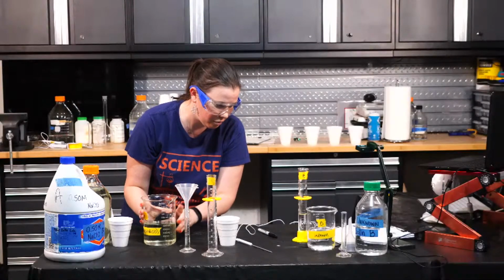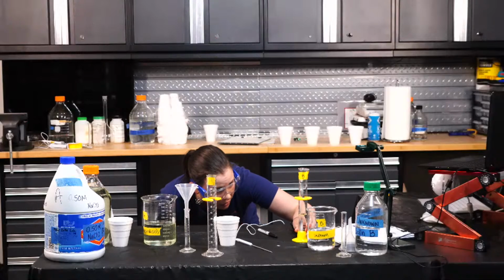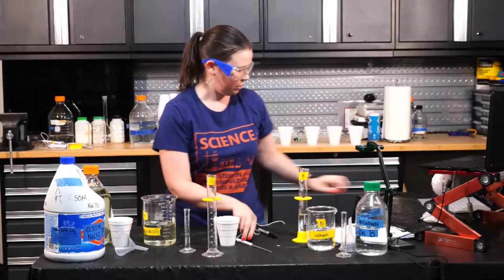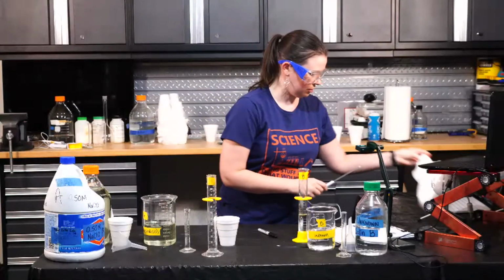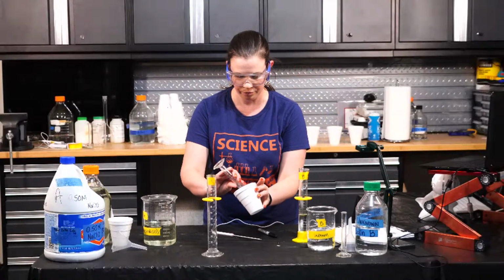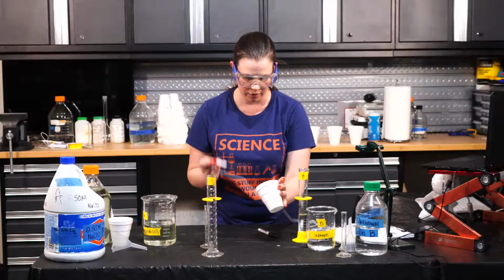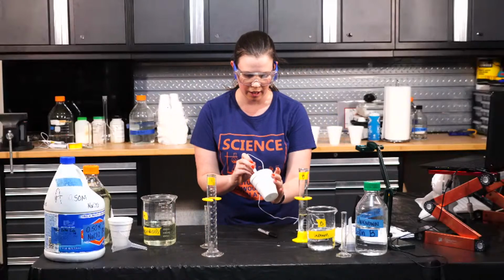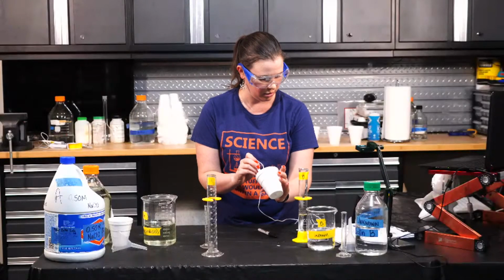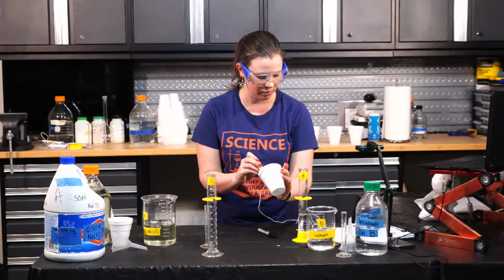Okay, so there's my 5 milliliters. And let me double check the volume on this. 45 milliliters. Wipe this off again. Put our 5 milliliters in. So now again, we're going to kind of gather the liquid on the side. And that looks better. We got 19.0 this time. 19.0 to start.